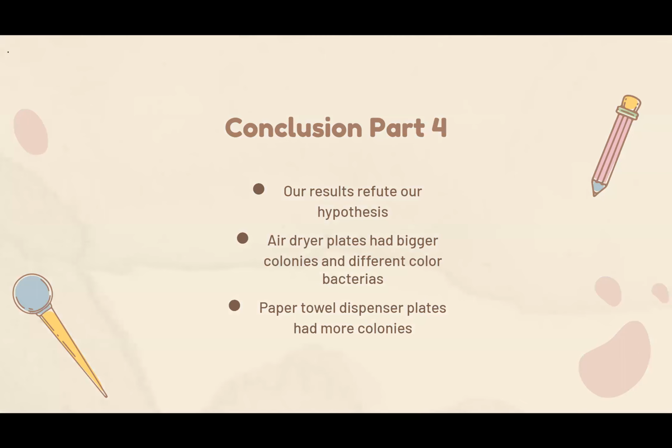So from our results, again, our results refuted our hypothesis. Although the air dryers had bigger colonies and different color bacteria and fungi, the paper towel dispensers, again, did produce more colonies.